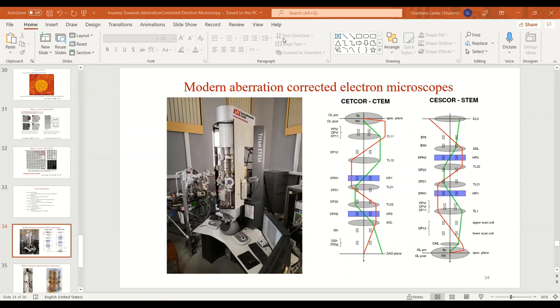I'm not working in the biological field, so I don't have any experience with the biological field actually. So I got this little aberration. Here is one more question. I am new in this field. From the lecture, what I got is that little aberration should still be there to get light elements detection. Am I right? If yes, can't we have any solution to it?